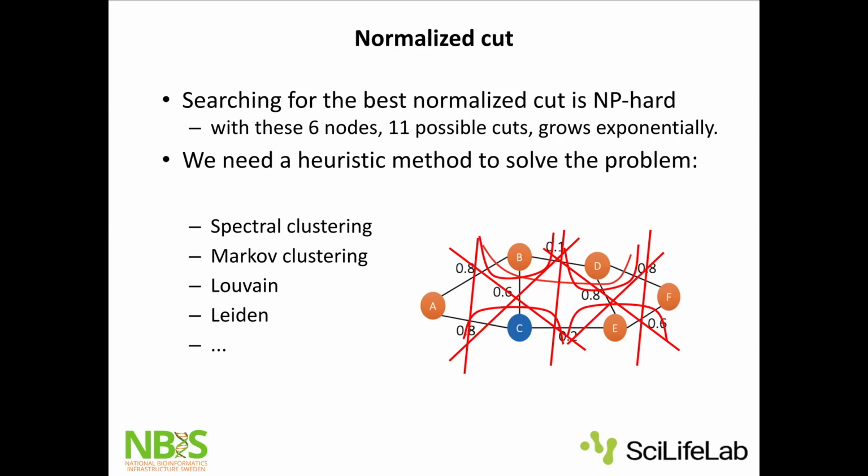There are a lot of different methods for optimizing community detection. I don't understand them exactly myself, and I'm not going to try to explain them. But here are some, and by trial and error, I think the community has stopped at Louvain and Leiden, giving reasonable clusters that make biological sense. I haven't really seen any strong argument for why those should be better for single cell than the others.